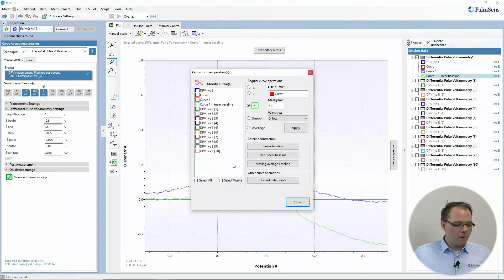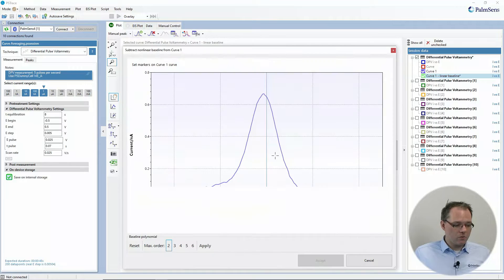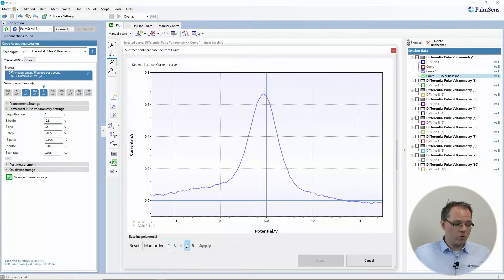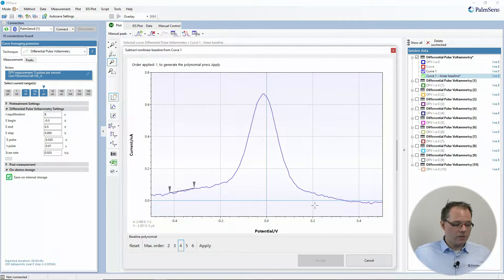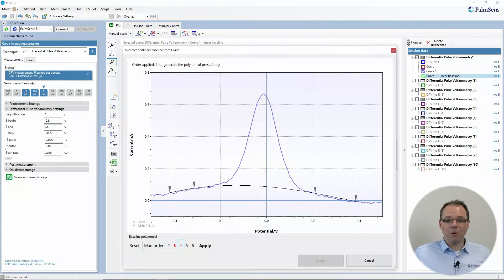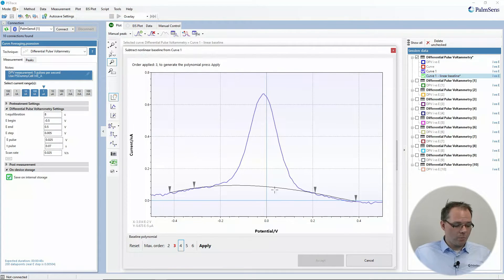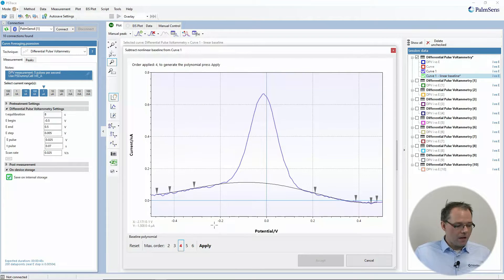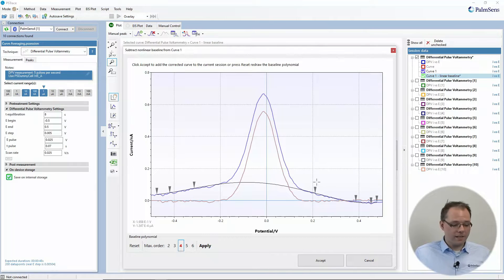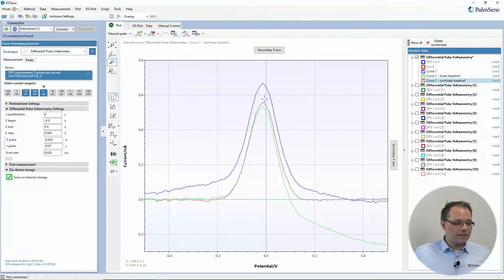Other options are a nonlinear baseline. Well, that works very similar, but you do it nonlinear. So you first choose the order of the polynomial that you want to use to fit your baseline. Let's say maybe four. Then you need to select the according points. The software is trying to find a polynomial that matches your points. So maybe let's add a few points. And then you can also say apply and you get your new baseline and then you accept it. So that's a nonlinear one.